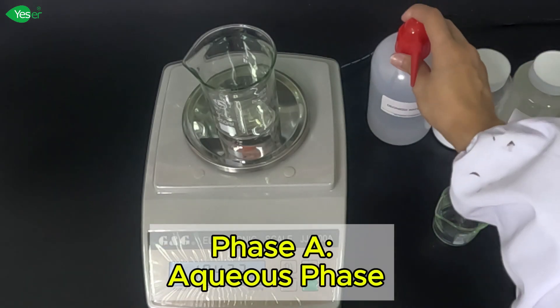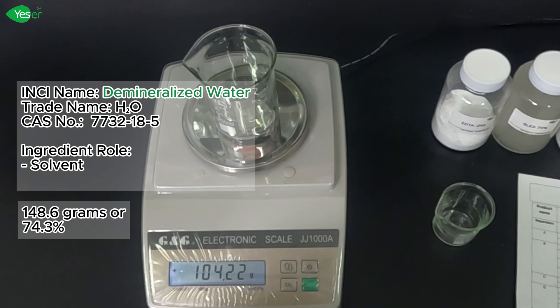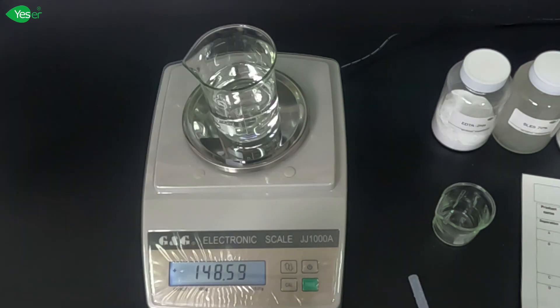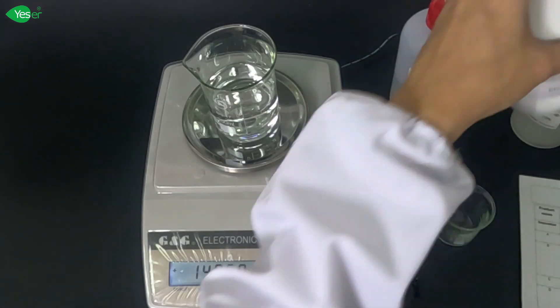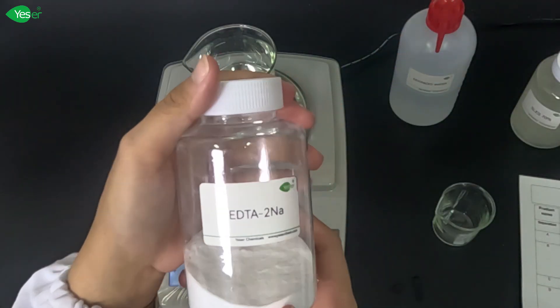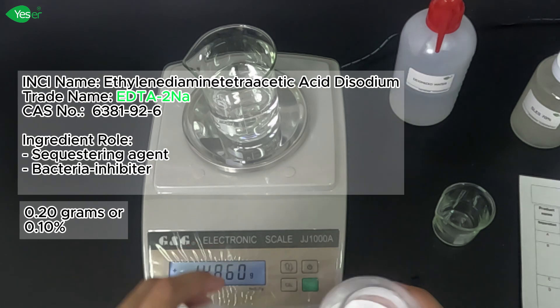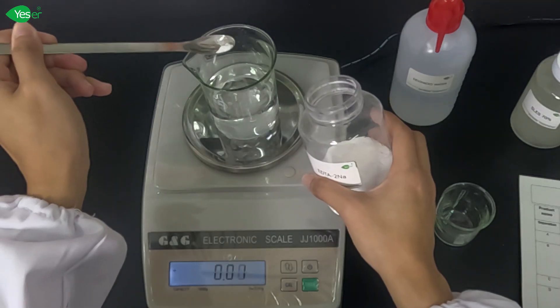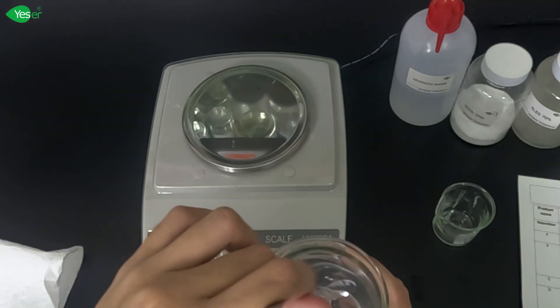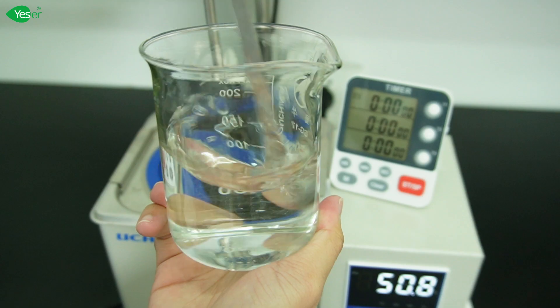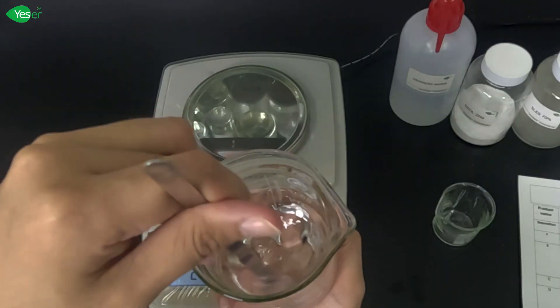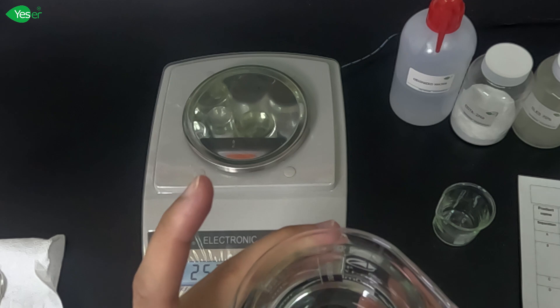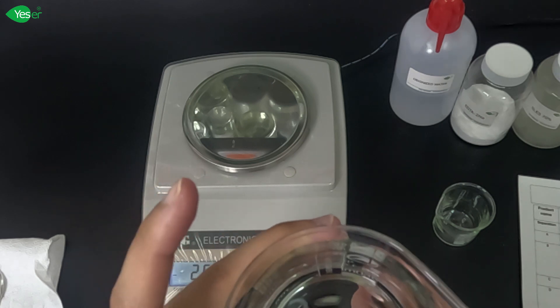First, we will measure 148.6 grams of deionized water, 74.3% for the formula. Next, let's add our chelating agent EDTA disodium. Weigh 0.2 grams of this, 0.1% for the formula. Stir this until it is fully dissolved. Now that our EDTA has been fully dissolved, we will heat this aqueous phase in a water bath at 60 degrees Celsius.